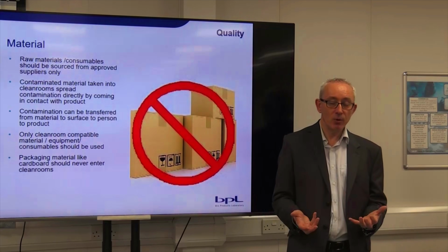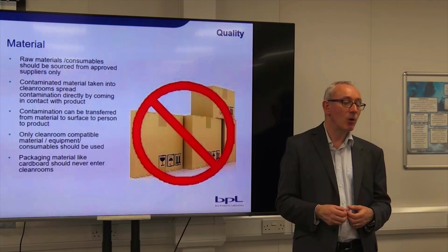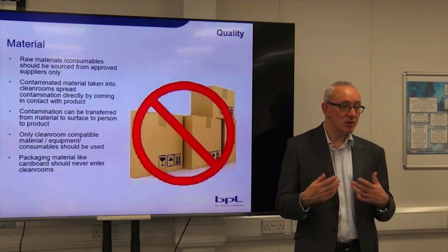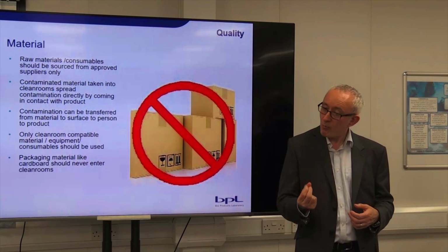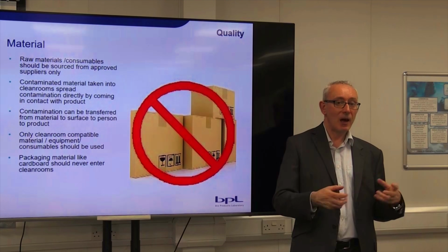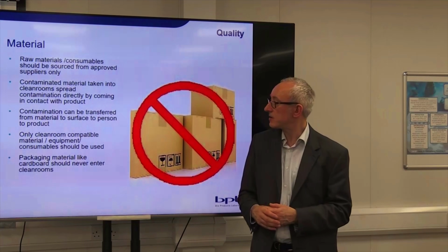For example, with the Gamaplex product, that requires a sugar called sorbitol, which is an example of a raw material. But that material needs to be of a low microbial level. There's no point having a very clean process and then adding microorganisms into the process.